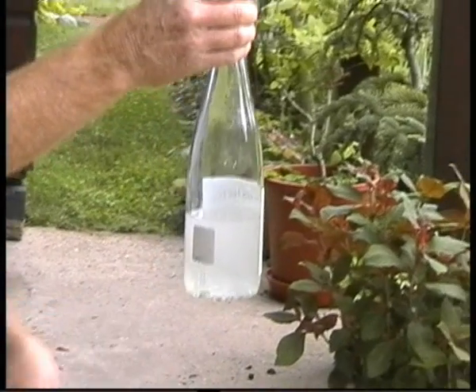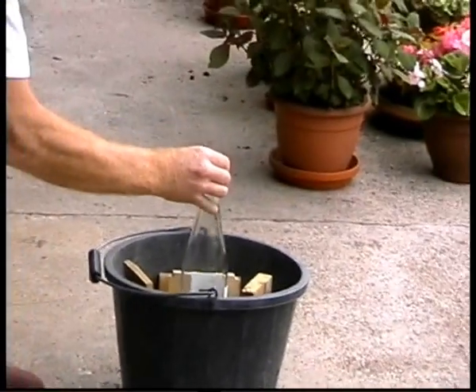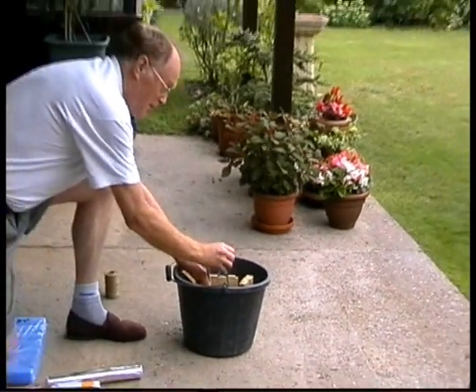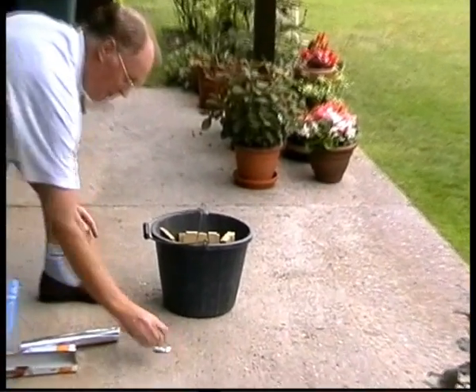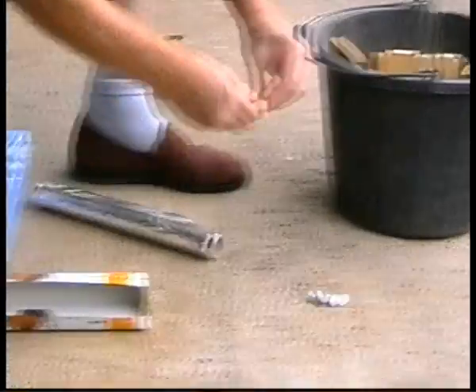Here we have some sodium hydroxide solution which I prepared earlier, taking all safety precautions. Putting it in a bucket because I don't want it to tip over, so that's stable. And we need some aluminium — we're going to use aluminium foil, screwed up into pellets like this.